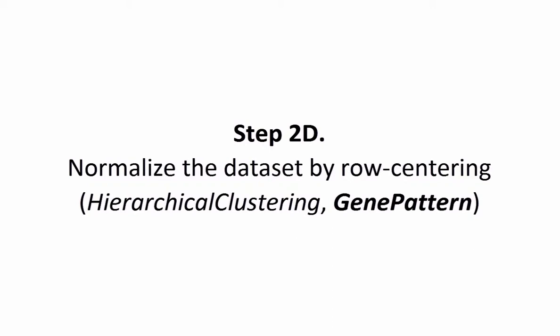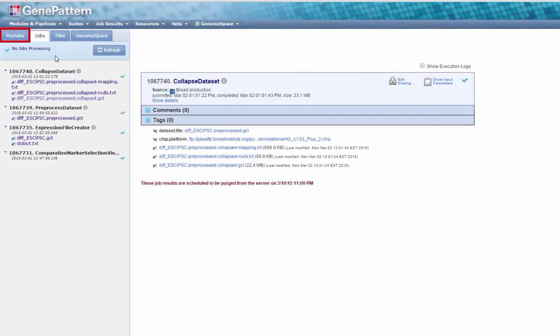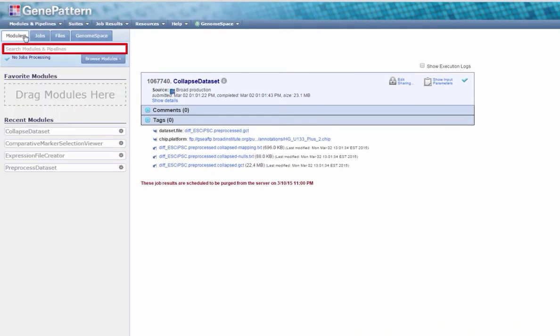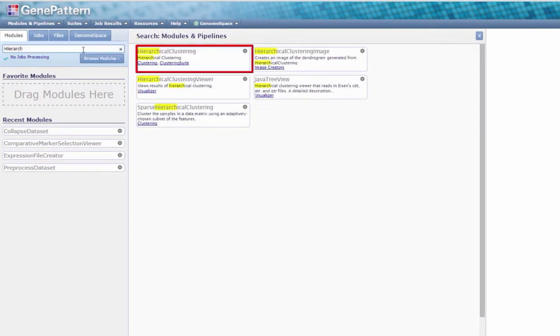Step 2d. Normalize the dataset by row-centering using the Hierarchical Clustering module in GenePattern. In the Modules tab, search or browse for the module Hierarchical Clustering and select it from the slide-out menu.